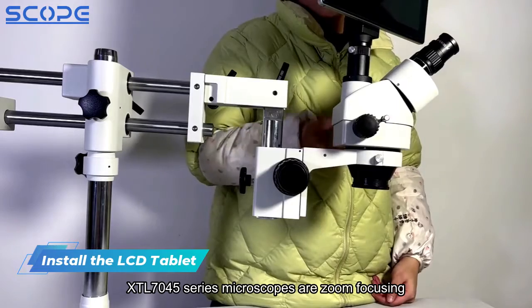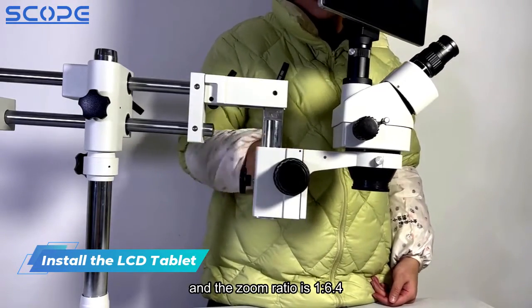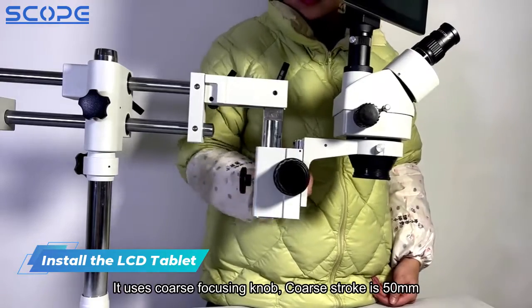XTL7045-Series Microscopes are zoom focusing, and the zoom ratio is 1 to 6.4. It uses a coarse focusing knob, and the coarse stroke is 50mm.